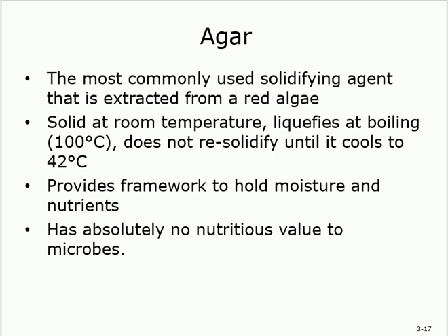So, mentioning the solidifying agents. Some of these media are semi-solid and contain solidifying agents, and the solid contains solidifying agents. What's a solidifying agent? An agent that can change the physical state into solid. Agar is the most common one. Agar is the most commonly used solidifying agent, and they get it from the red algae.